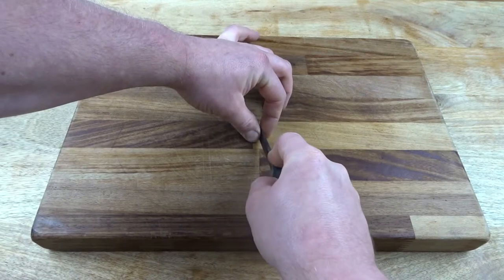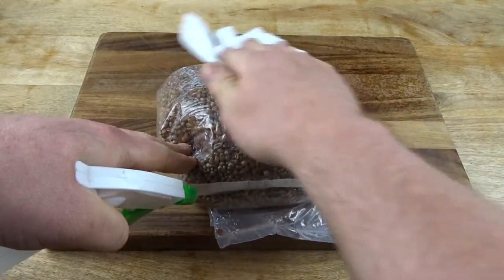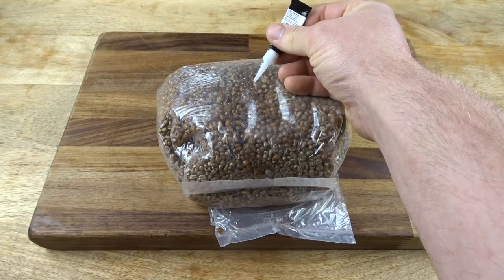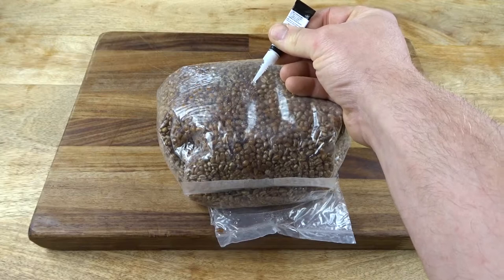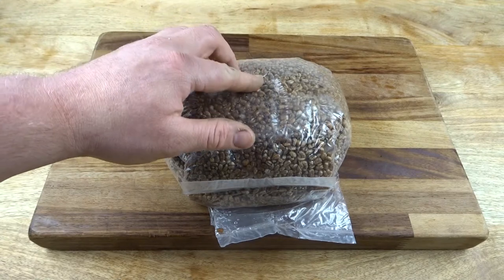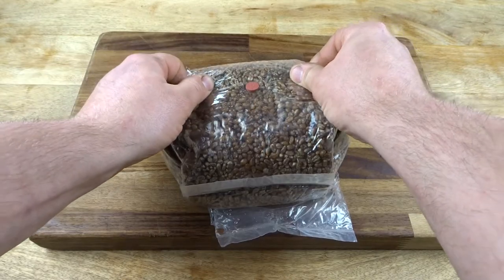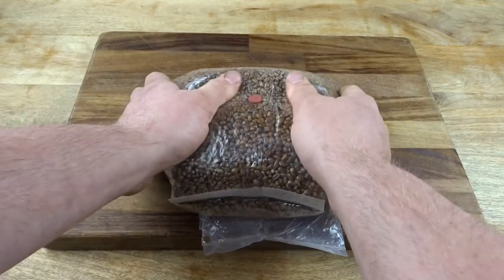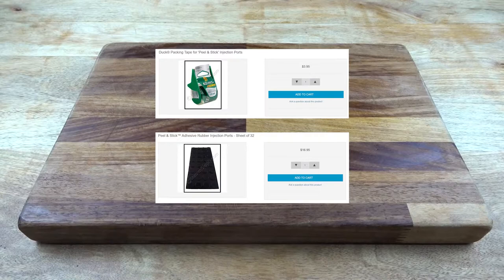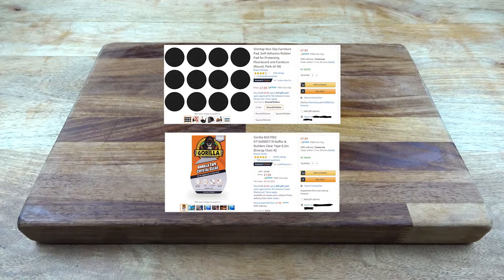However, this method is at risk from breaking, as the little stem that goes through the bag is the weakest part. Dropping, mixing or knocking the bag can cause these to come off easily. It also means having to wait 24 to 36 hours for the silicone to go off each time before you use these bags. Another commonly used method is gluing on a trimmed down butyl injection port — you glue this down with a high temperature epoxy and then overseal with tape. However, different glues melt at different temperatures, so the injection ports can slide around during the sterilizing cycle. You can always add the injection port after sterilizing, just be mindful that the ports and the site are cleaned with isopropyl alcohol. There are also peel and stick injection ports sold by Shroom Supply, though I'm convinced this is just a sheet of rubber furniture feet oversealed with duct tape.